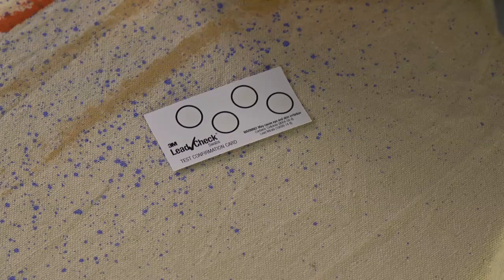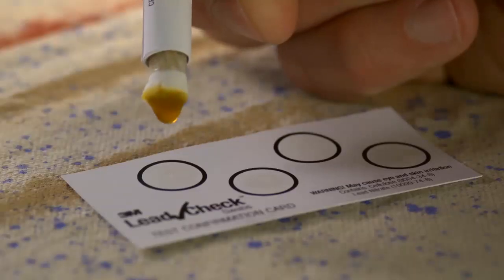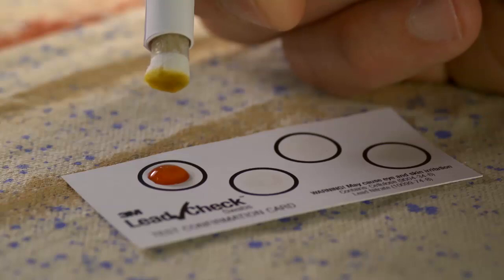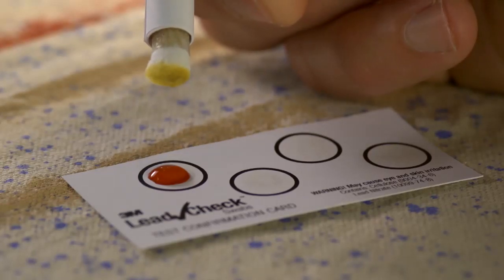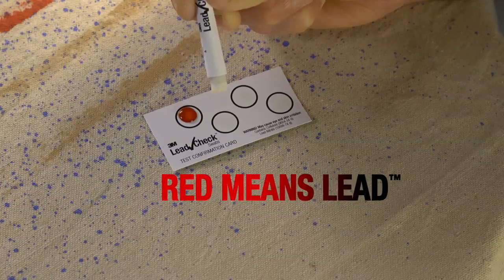If the test is negative, confirm the reactivity of the 3M Lead Check reagent by squeezing a drop of the reagent liquid onto one of the test confirmation cards. The circle should instantly turn red. Don't forget, red means lead.